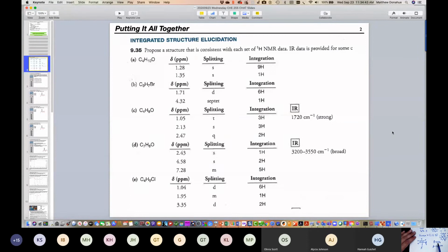And then if you consider if this is a fragment and that's a fragment, how many unique sets of hydrogens are in this fragment? So there's just 1, right? So this has to be the right answer here. So we just join those 2 fragments together. So that gets us our 5 to 2 to 1.